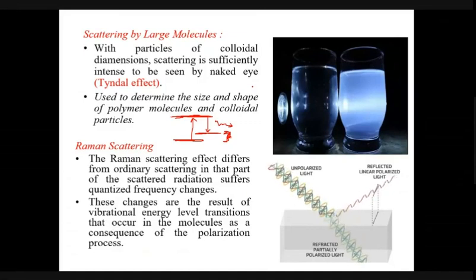Now, in Raman scattering, when energy is acquired and energy is released, the molecule goes from one energy level to another energy level. Now this energy difference is fixed. It is quantized.